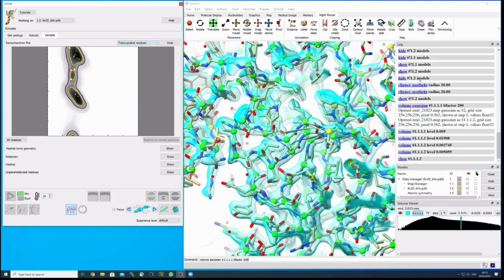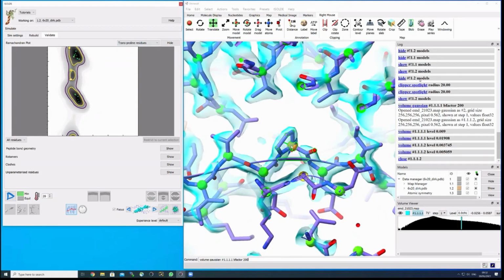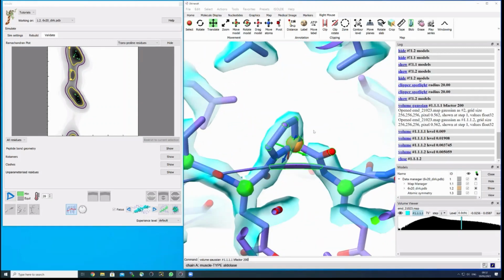Since trans-proline residues here are a bit special, you can actually go onto one of these dots and you will see where these residues appear. There are actually 4 of them, and this is because it's a tetramer. You find them at position 188 in all of the 4 chains. If you click on them, you will be sent to this position and it will be centered.